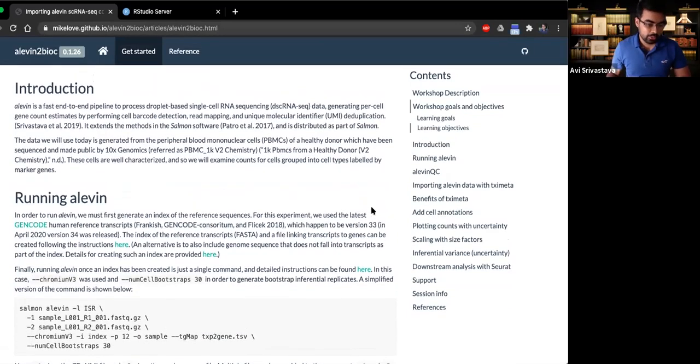Yes. Okay. Thanks, Mike, for handing over and letting me be part of the workshop, and thanks everyone for joining. Before we move on to a very magical R world, I just want to give some motivation. Why do you want to rethink how you actually get the gene versus cell count matrices, which lots of R packages are written around and processed to do cool visualization or generate downstream analysis from them?